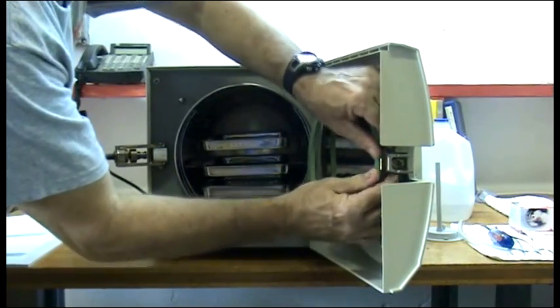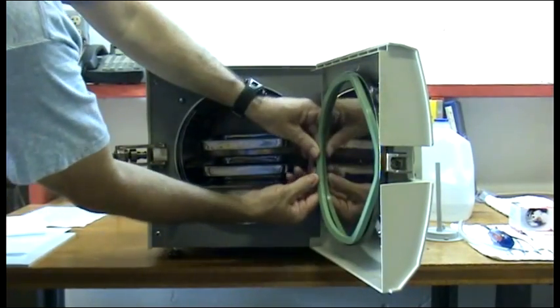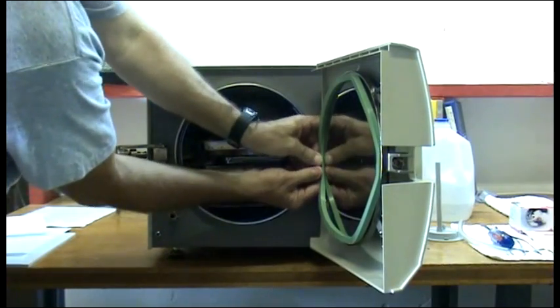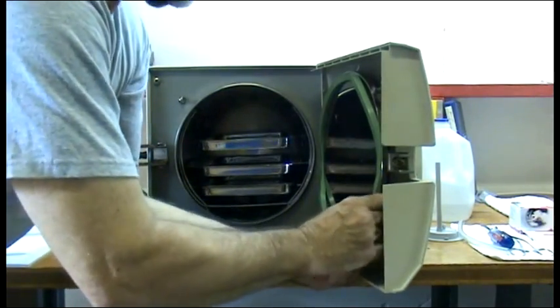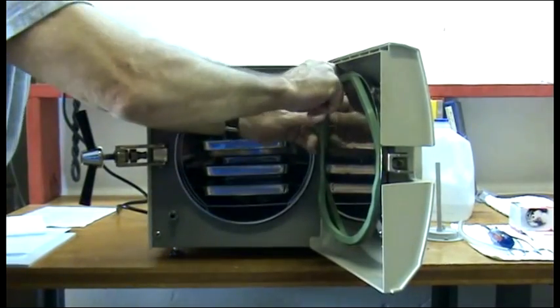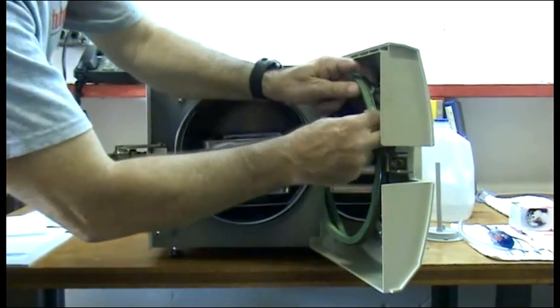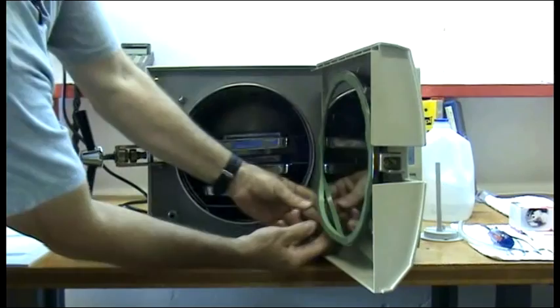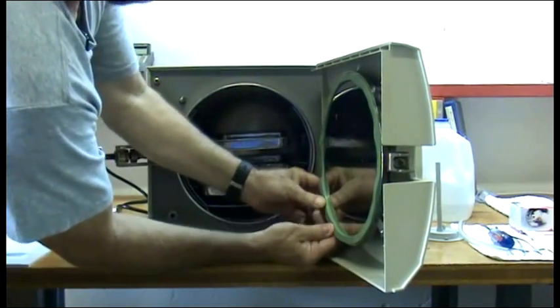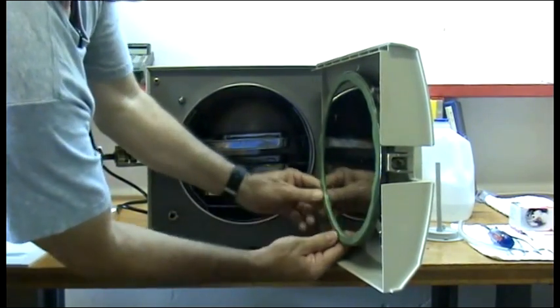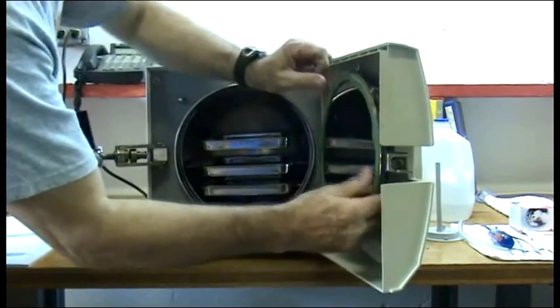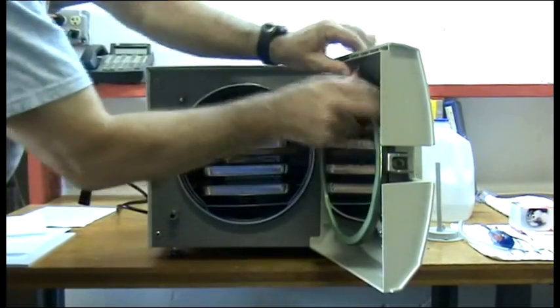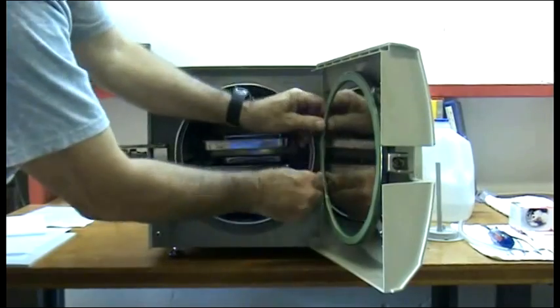Then the three o'clock, then the nine o'clock. Keep going around opposing sides until the gasket is firmly seated all the way around. Run your thumb all the way around and evenly press in the gasket.